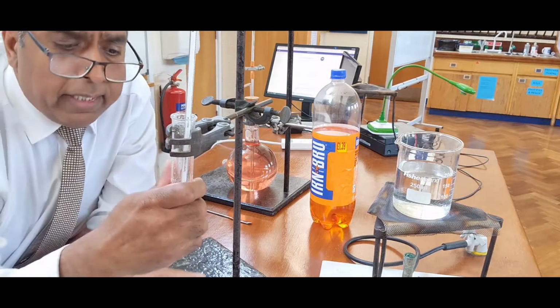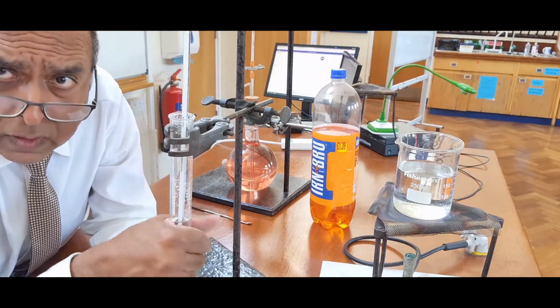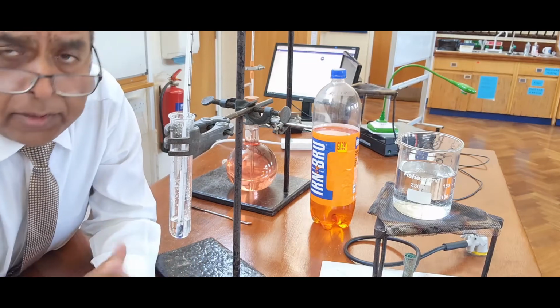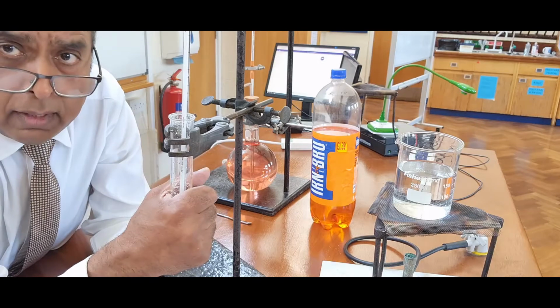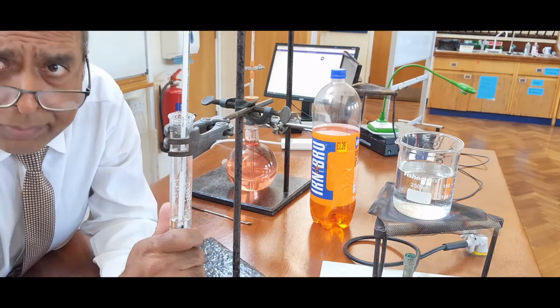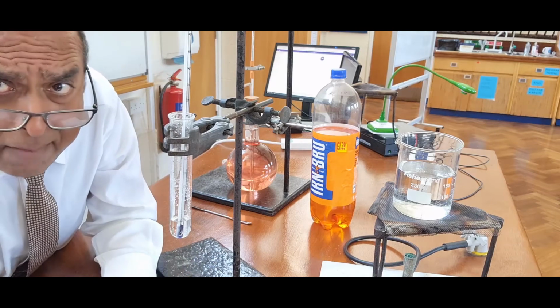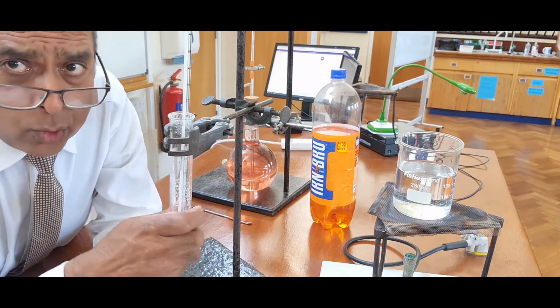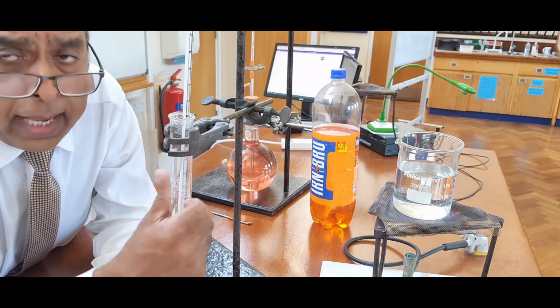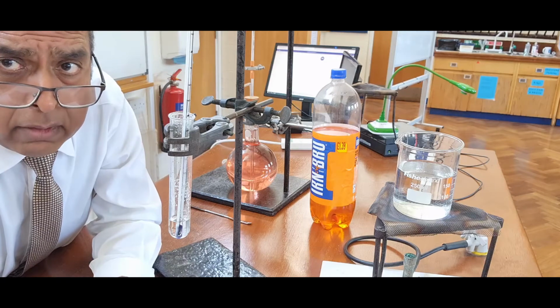If we leave it, it'll cool down. As it cools down, the solubility of ammonium chloride will get less and less. And by the time it reaches room temperature, as you saw when we started, that amount of water won't be able to dissolve 2 grams of ammonium chloride.